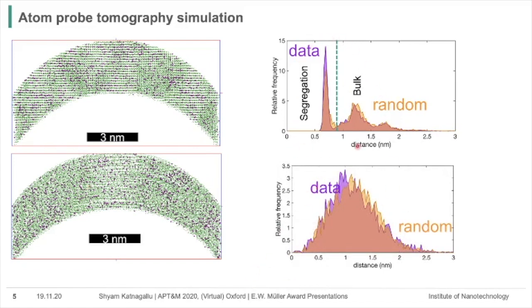So even though we put rhenium into a bimodal distribution state in the simulation, this rhenium nearest neighborhood is being destroyed by trajectory aberrations because of the really high electric field of rhenium evaporation, which gives rise to this random distribution of rhenium atoms inside your volume.